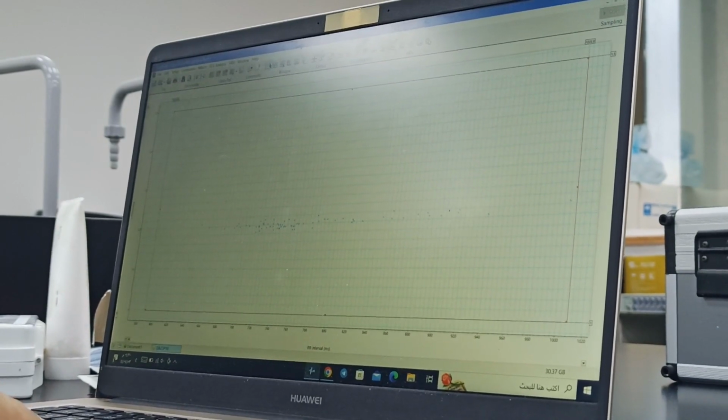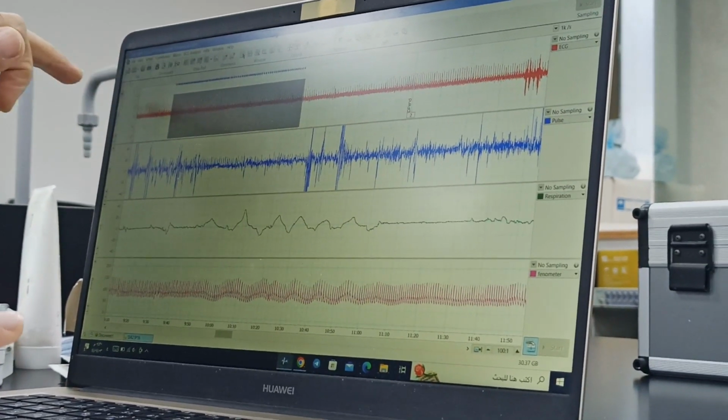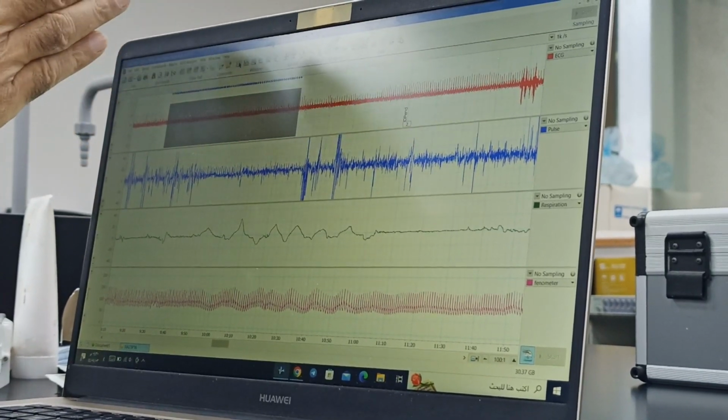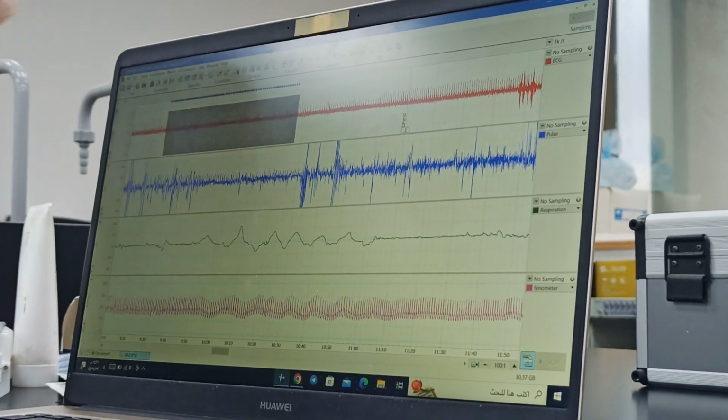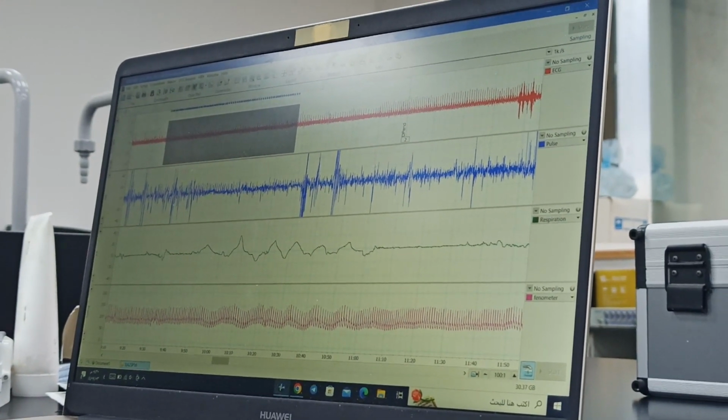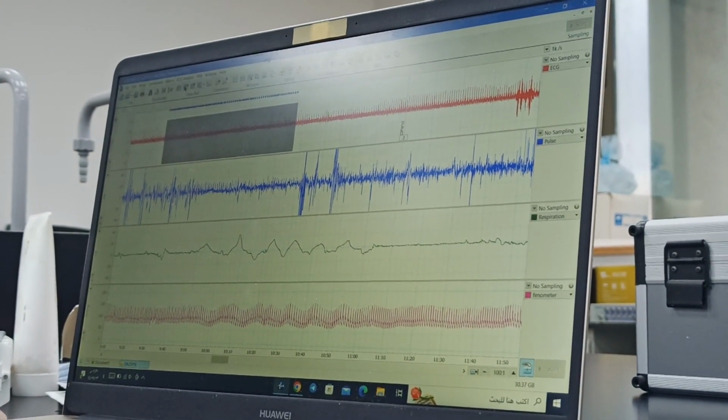So now we go back here and see all of them. So you see that blue dots, they are coming closer and going apart. This is the variation. This is the variation. Add to data pad.